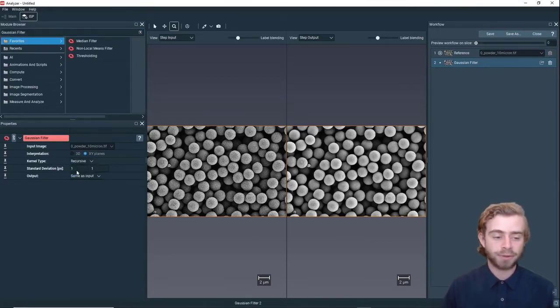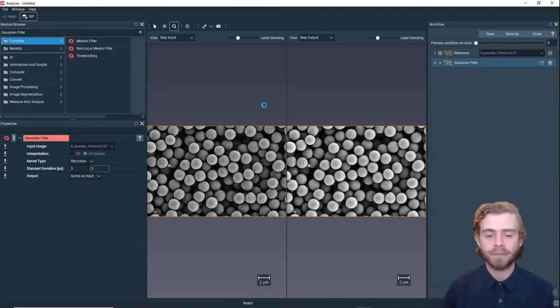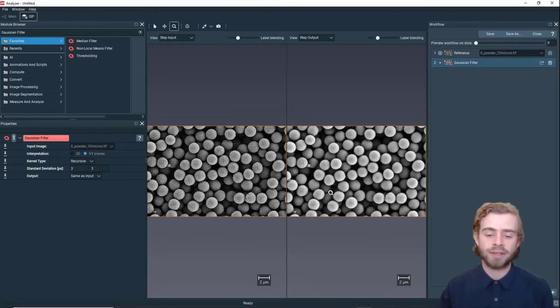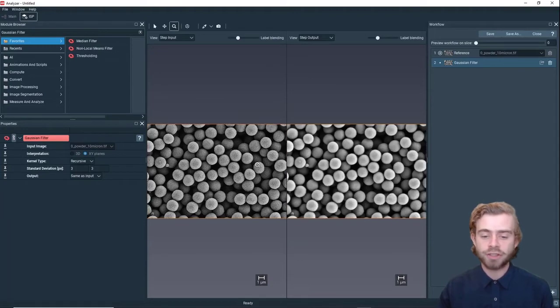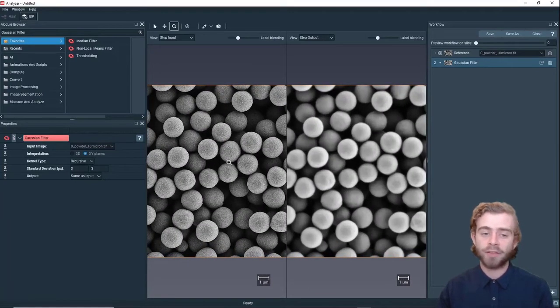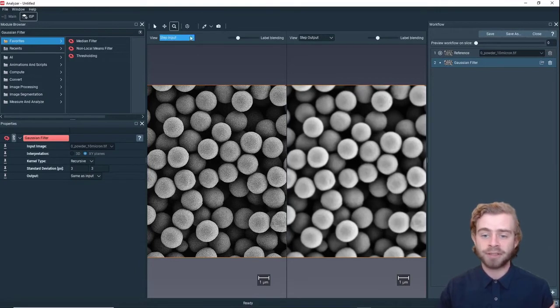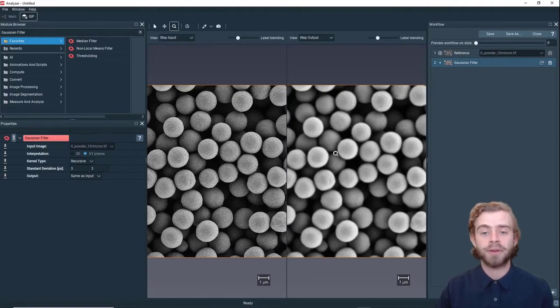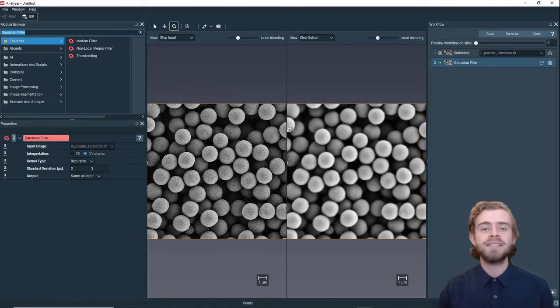We're going to change the kernel type to Recursive and set the standard deviation to 3. The goal of the Gaussian filter is just to smooth the image. If we zoom in, we can see that on the left side — which is the step input to the Gaussian filter — it's a lot more rough, and on the step output on the right side it's a lot smoother.